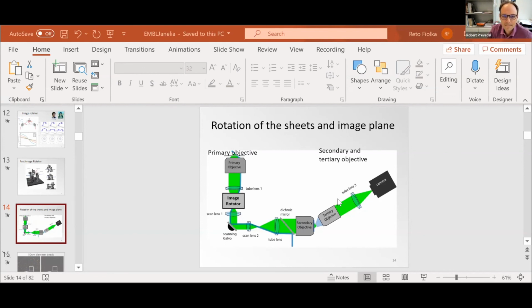So without going too much into the detail, we still did the reconstruction a bit simplified. If you're aware of what different SIM algorithms exist, there is a way of doing slice by slice. So even though data is 3D, even in a 3D SIM, you can treat it slice by slice. We just did that for a lack of having someone who really wanted to dig into the algorithmic side.